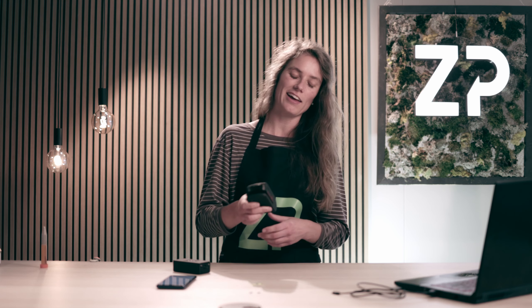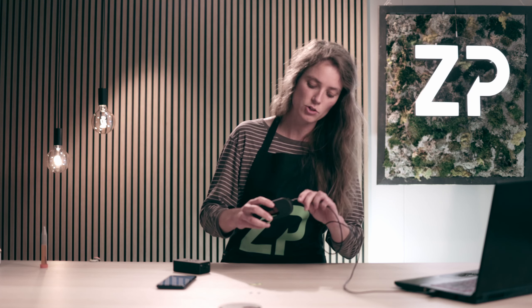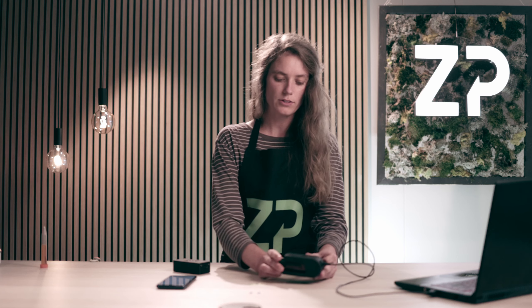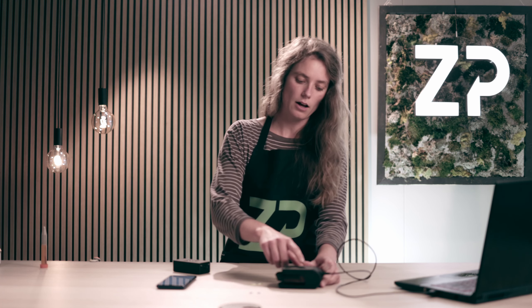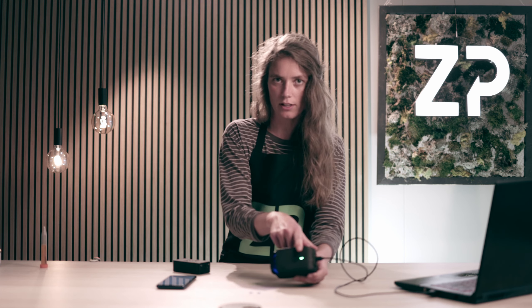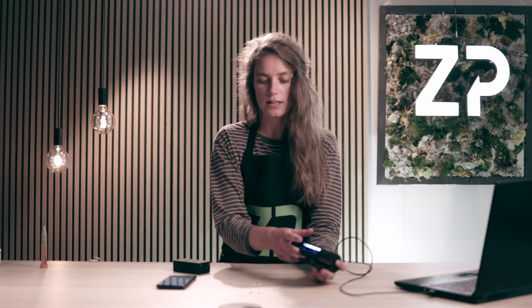So let's give it a go and see just for yourself how smooth it is. First, I need to connect it to a power source. Then I will press the power button for two seconds, just so that the green light turns on indicating that the device is on. You'll also see a blue light here blinking, which indicates that it's not yet connected to Bluetooth.